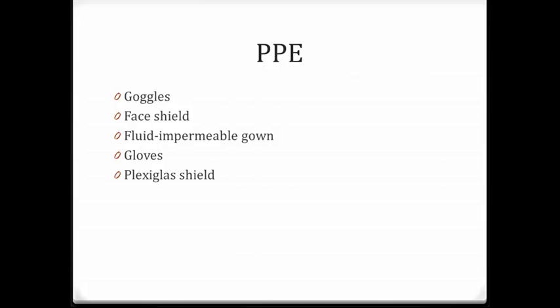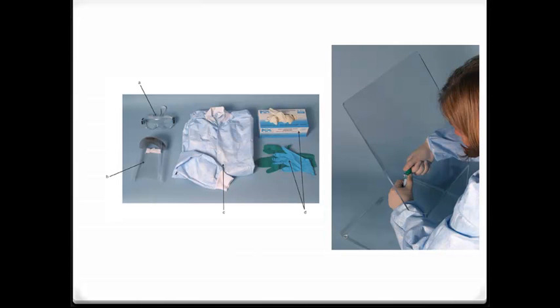PPE, or personal protective equipment, includes goggles, face shields, fluid-impermeable gowns, gloves, and plexiglass shields sometimes used in high splash areas. Here is a picture of goggles, face shield, gown, gloves, and a plexiglass face shield.